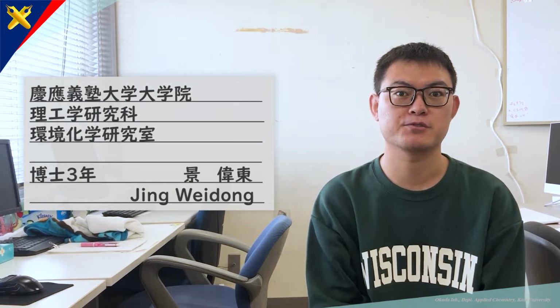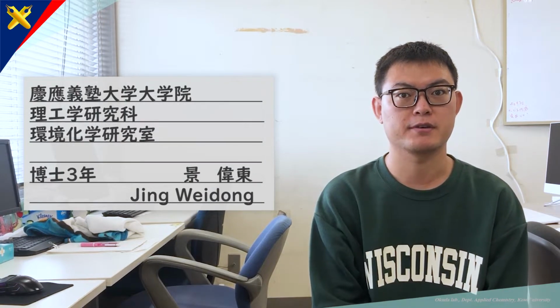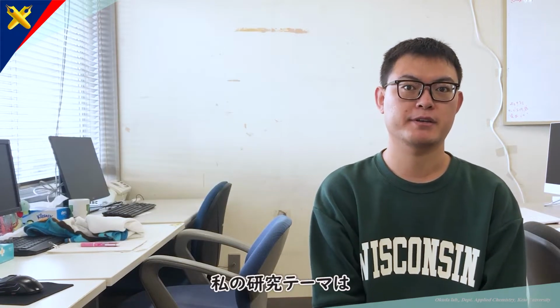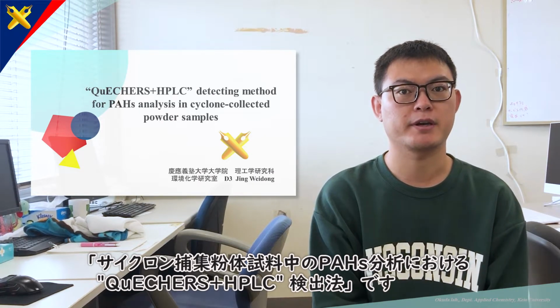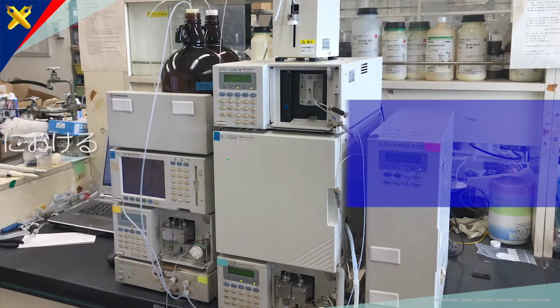Hello everyone, I am Jing Weidong, a third-year doctoral student in Professor Okuda Sensei's Environmental Chemical Chemistry Lab, and my research topic is QuEChERS and HPLC detecting method for PAH analysis in cyclone collected powder samples.